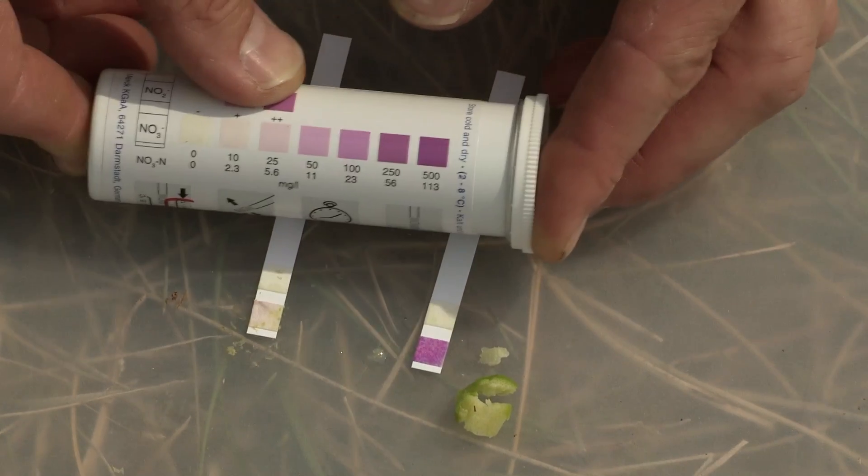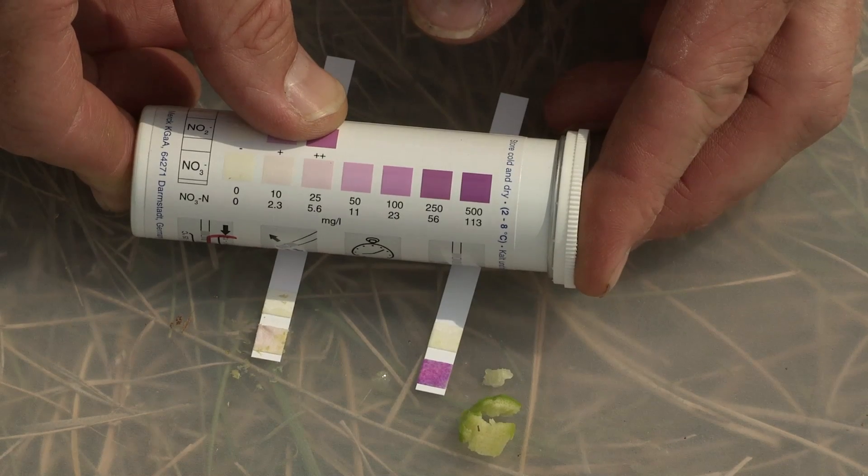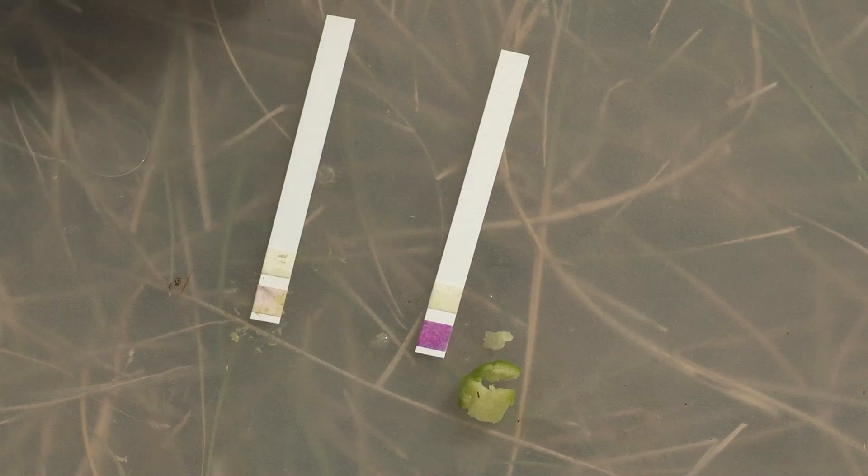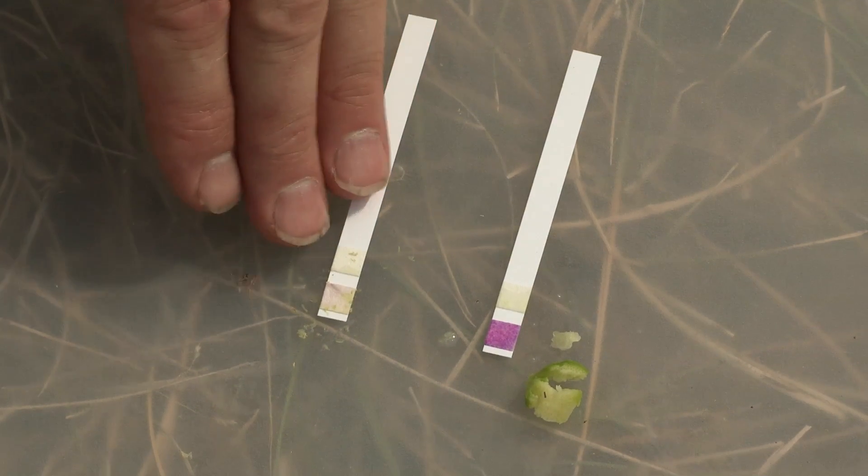In the case of the sudan grass we just checked, we see very little or no color change. We're approaching a minute right now. So the producer would be safe to go ahead and graze his cattle on that sorghum sudan grass that we tested there.